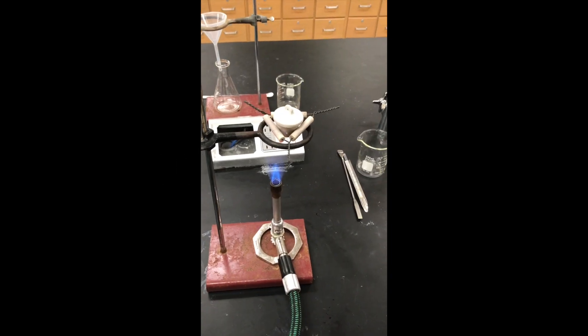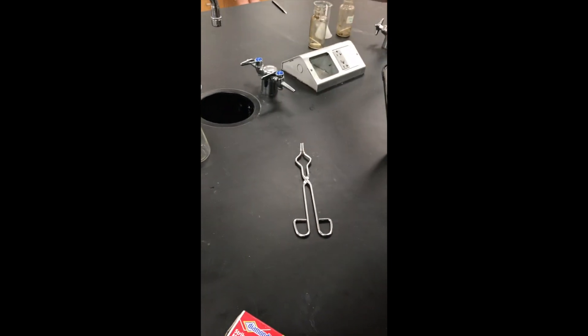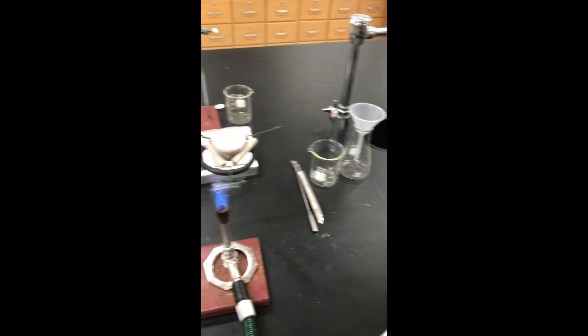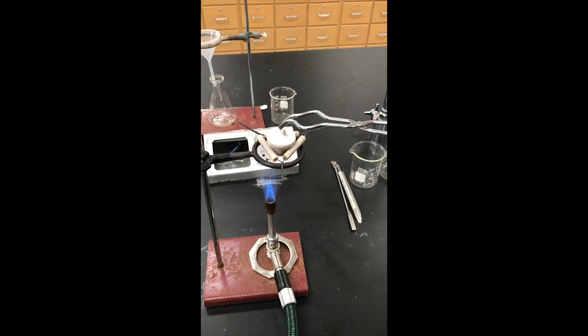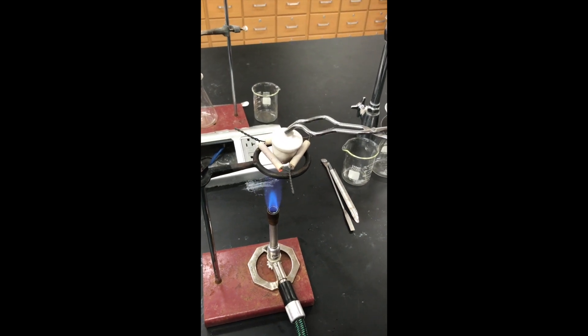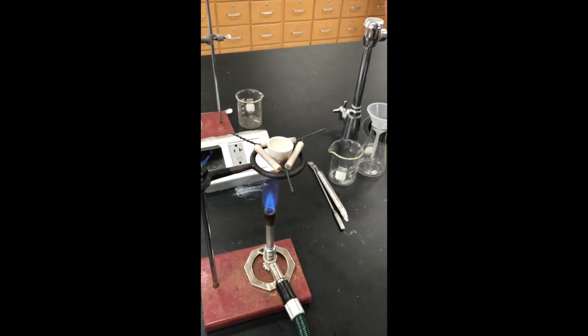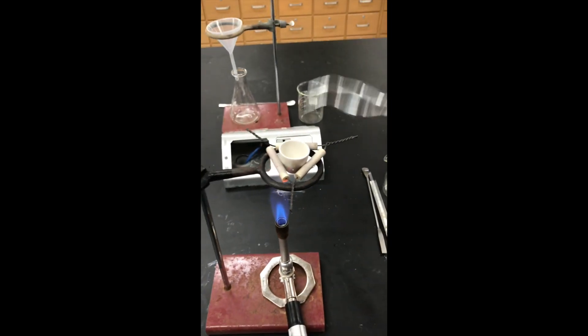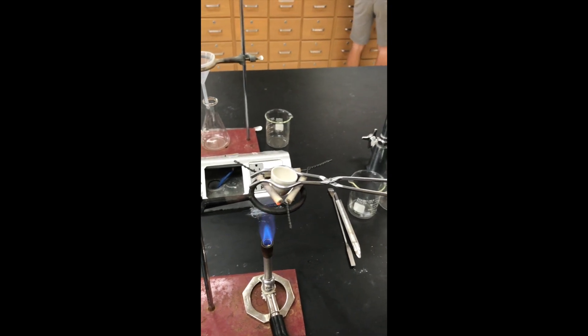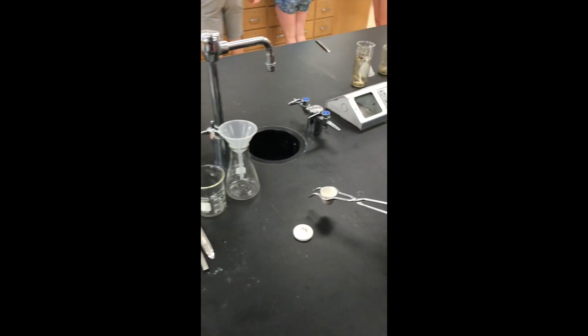When you want to remove your crucible, you will use the tongs to get the crucible off the hot flame. Be aware that you do not remove the crucible with your hands. I've done that before. It's very hot. You use the tongs like that and set it down safely.